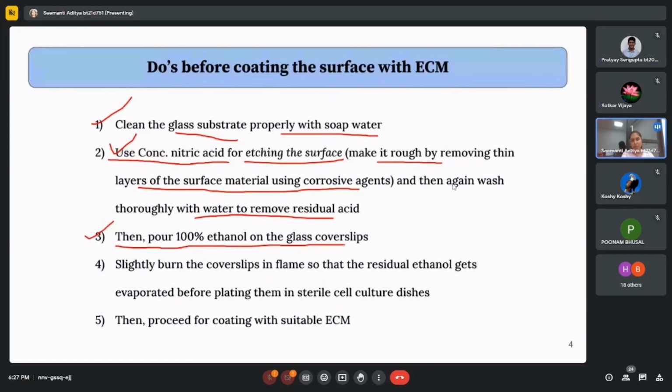It is to remove contamination basically. 100% alcohol is a disinfectant, and during cell culture alcohol has to be your best friend, because whenever we are performing cell culture, we need to properly wipe our hands with alcohol, wipe the desk with alcohol, the hood with alcohol, everywhere. Wherever you put yourself, there has to be alcohol.